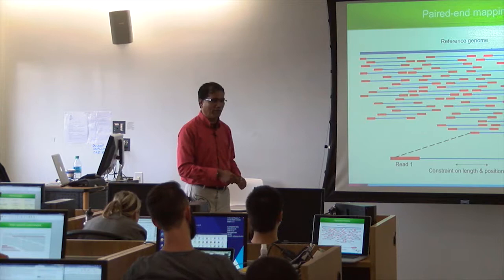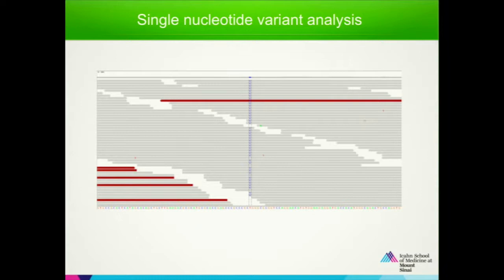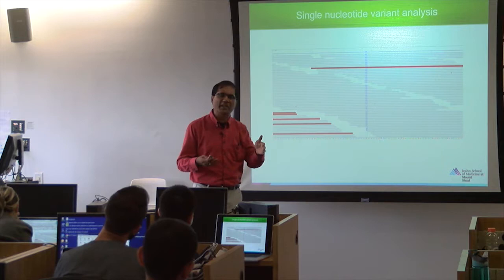But here, whatever is available now, we use the reference genome to align and get one big long strand. And why do we require depth of sequencing? Because if you see only one strand, if you sequence 1x, whatever mutations or indels you see could be genuine or could be mistakes during sequencing. That happens. So how do you detect that? That's why you have to sequence many, many times, the same human sequence, 20, 30, 40, 50, 60 times. Initially, people did it several times to see what is enough. Now for the human genome, they say 30x is enough, but for exome, depending on what you want, you can go from 40x to 200x.